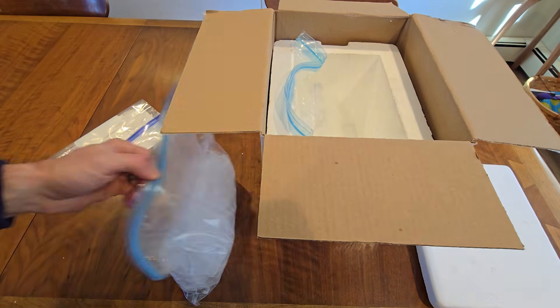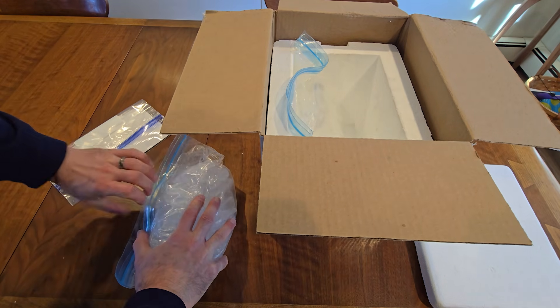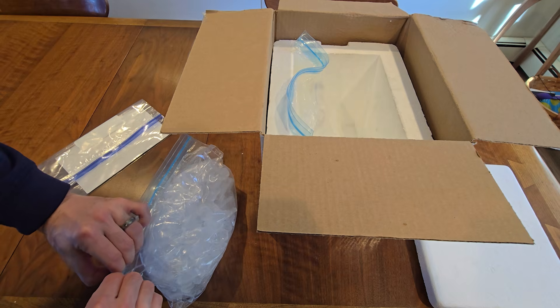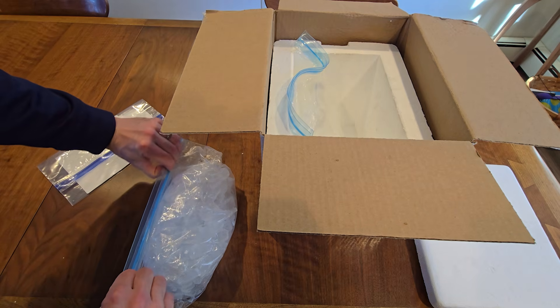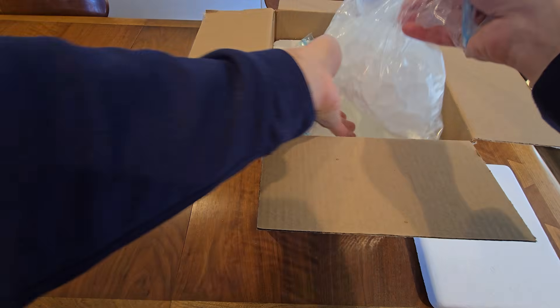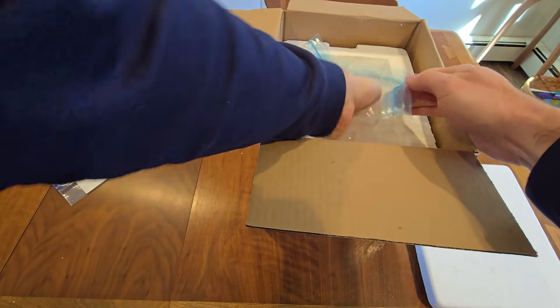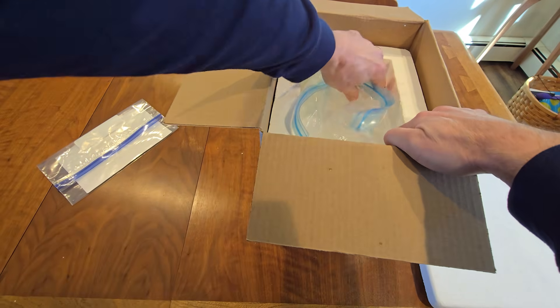Open part of the zipper on the second bag of ice and again squeeze out as much air as possible. Then reseal the bag making sure that it's fully closed to avoid leaks. Put this bag into the other side of the foam cooler so that both zippers are facing up.